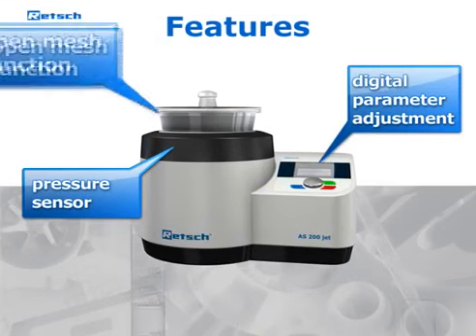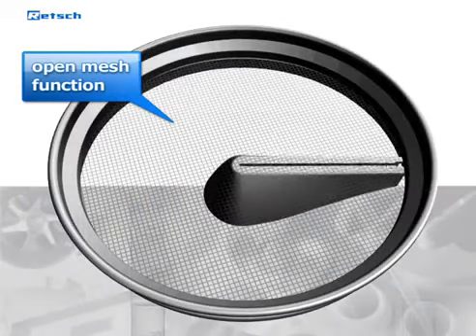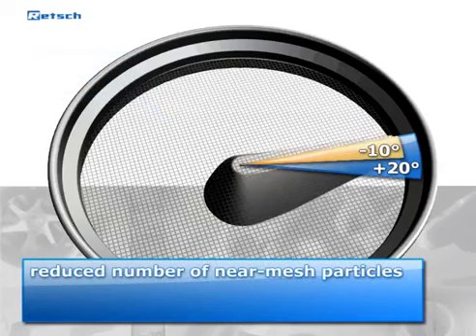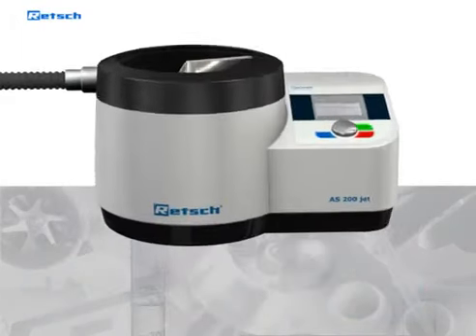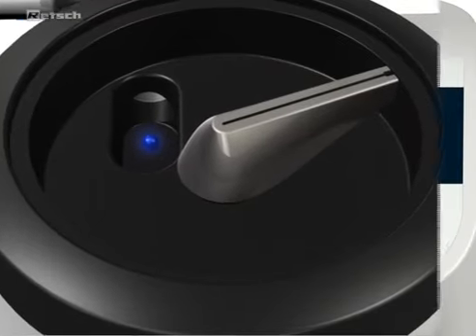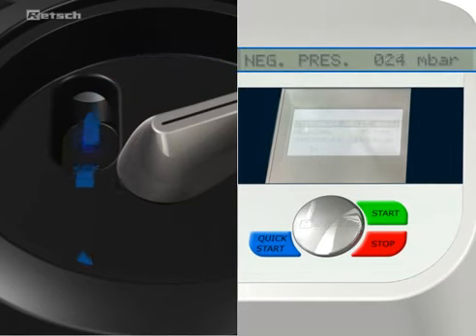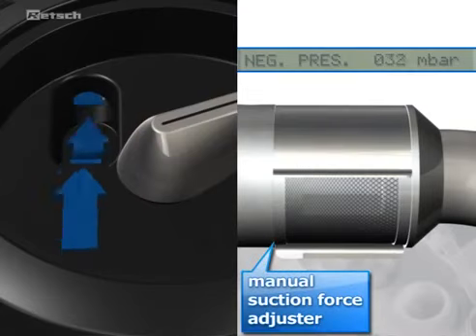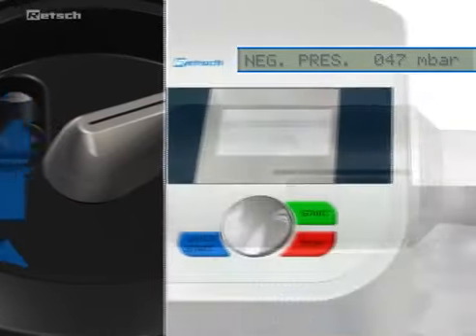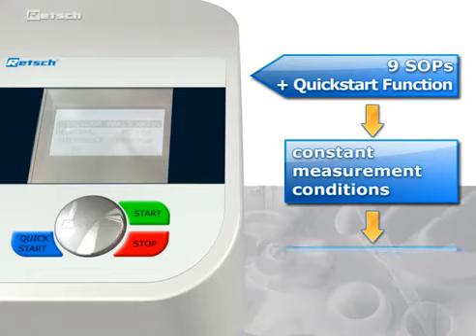Thanks to some special features, the AS200Jet allows for extraordinarily reliable and reproducible sieving processes. The open mesh function, a procedure which greatly reduces the number of near mesh particles, provides optimum separation efficiency and excellent reproducibility. A highly precise and sensitive pressure sensor inside the device constantly measures the negative pressure, indicated on the display. The generated negative pressure can be continuously controlled via a manual suction force adjuster. Time and revolutions per minute are adjusted digitally, and nine standard operating procedures can be stored for routine sieving processes, ensuring reproducible measurement conditions independent of the operator.